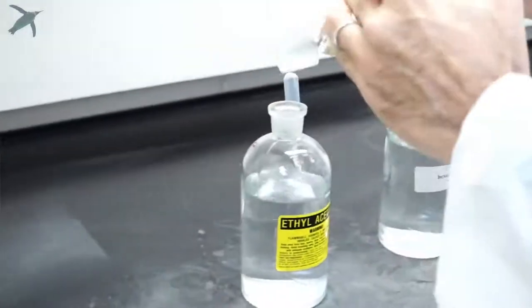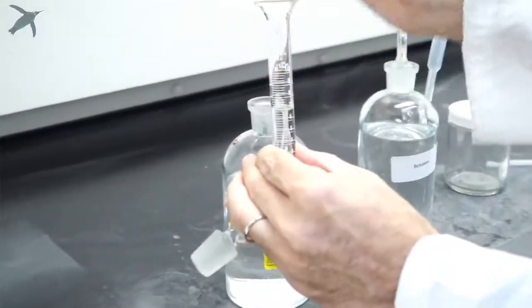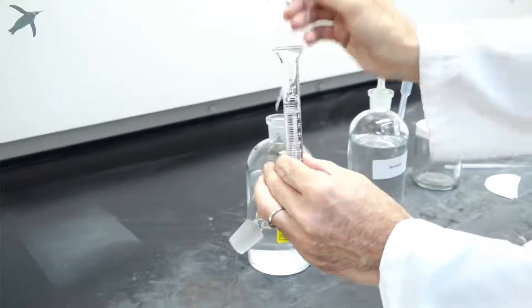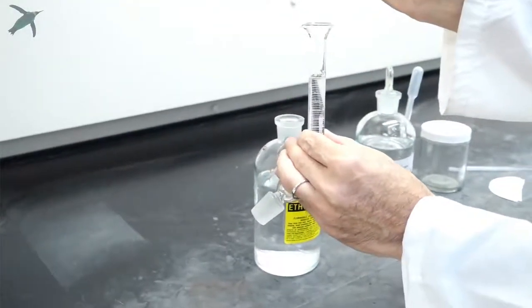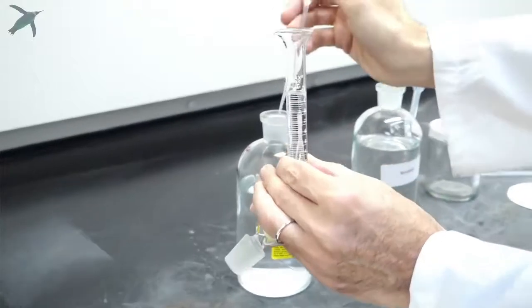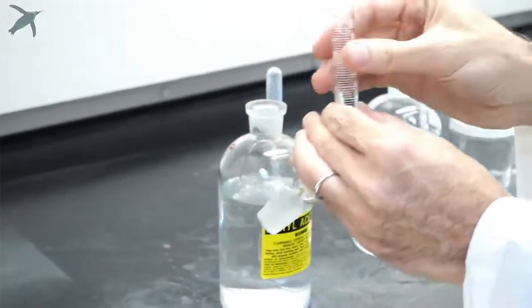And then you add your 3 mLs of ethyl acetate. Like so. You return the excess to the bottle and return the pipette.